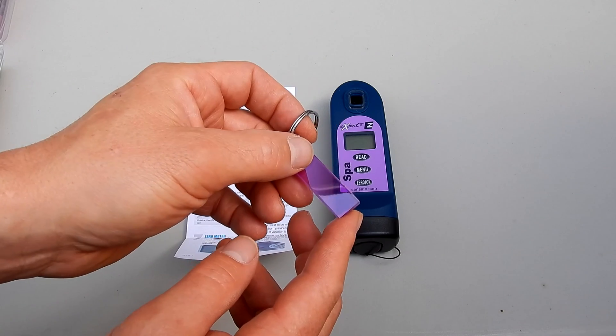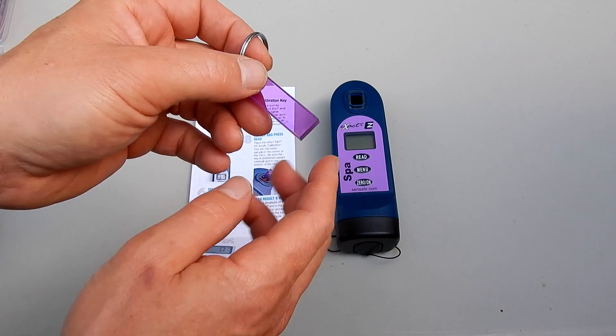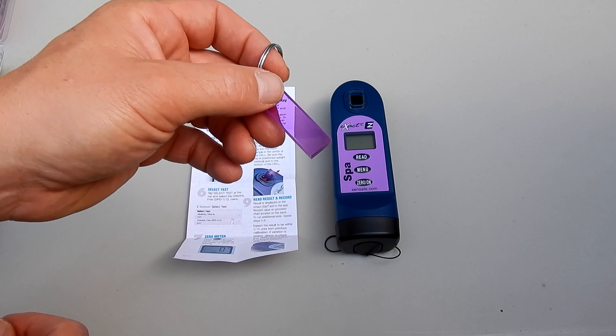Also included is this acrylic calibration key. All the units have been factory calibrated. This is just used to verify the calibration of the unit.